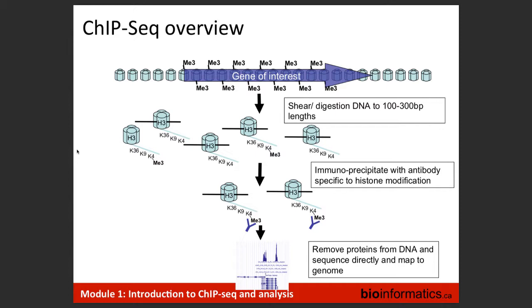And there are two main ways to do this. One, using an enzymatic process, usually MNase, although there are other enzymes that are used. So MNase digesting the genome. Another way to do it is to use sonication, so just cavitation to actually shear the DNA, to generate a series of fragments. More recently, technologies have been developed using transposons, which actually insert between the histones.